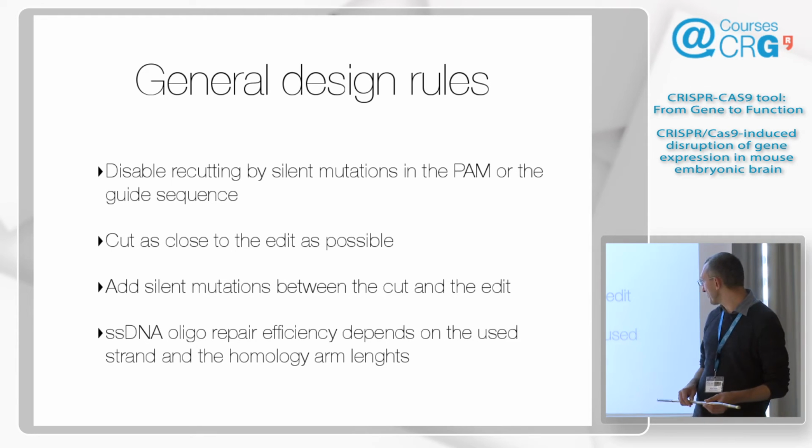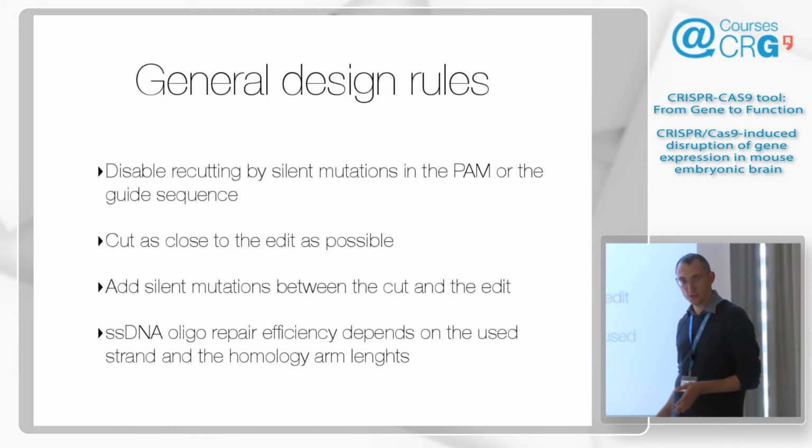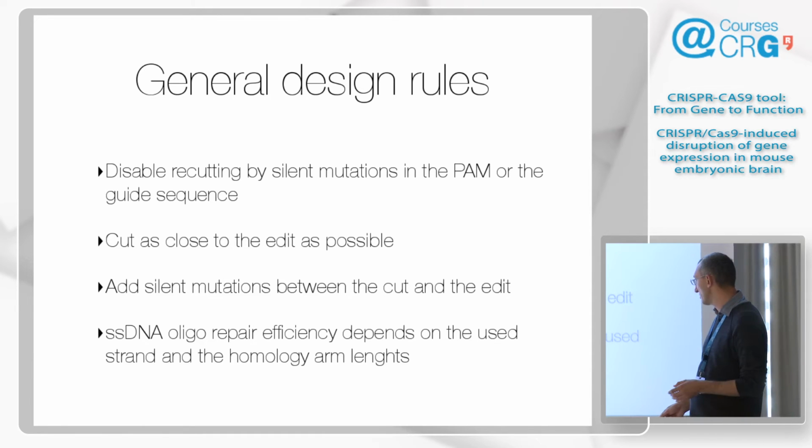All right, so oligo repair efficiency depends on the strand you use, and I'll cover this in the next slide. So this is crucial, which of the two strands, because it's single-strand DNA, you can use either one.